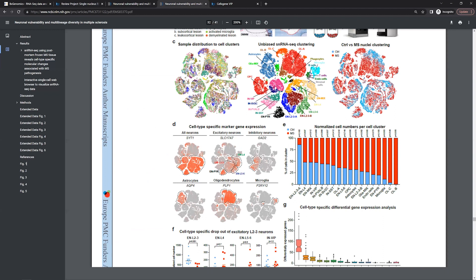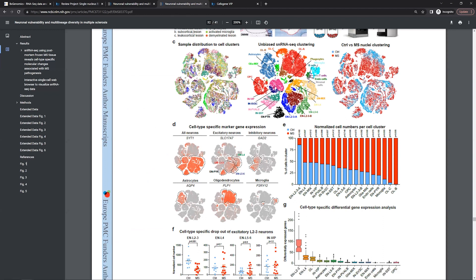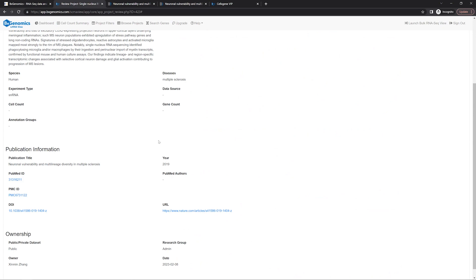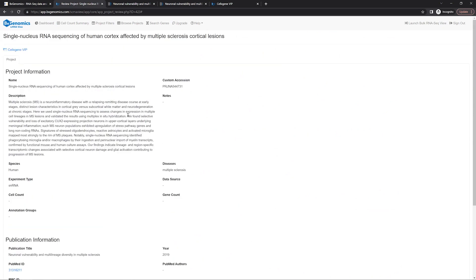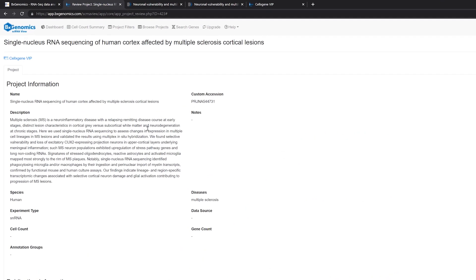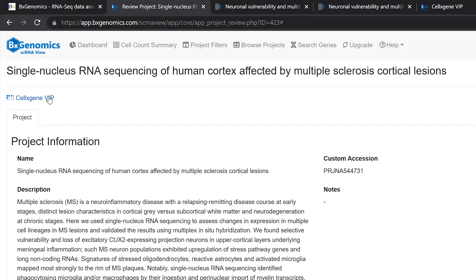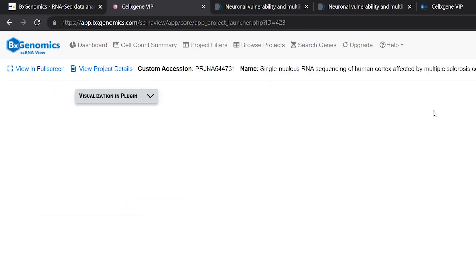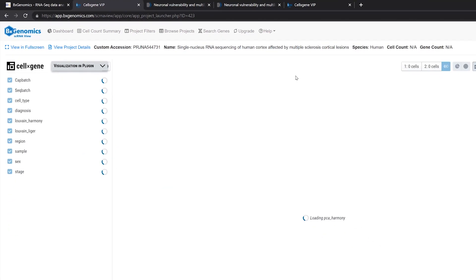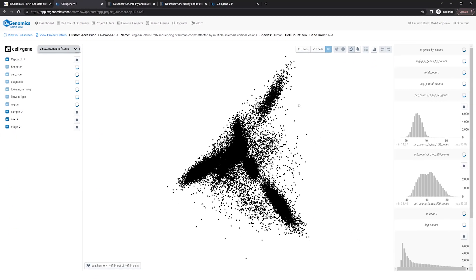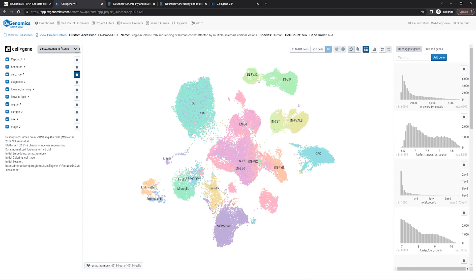Today, I'm going to try to reproduce several figures from the paper using Cell-by-Gene VIP. From the project page, click the Cell-by-Gene VIP link to start visualizing the results. The system is fast — in a few seconds, all of more than 40,000 cells and associated annotations are displayed.